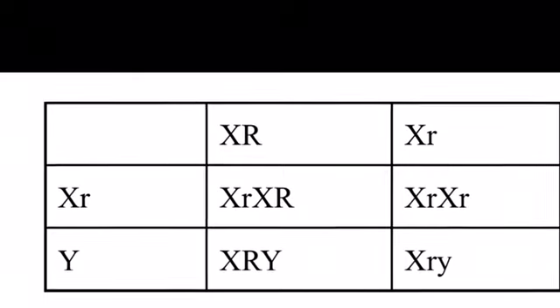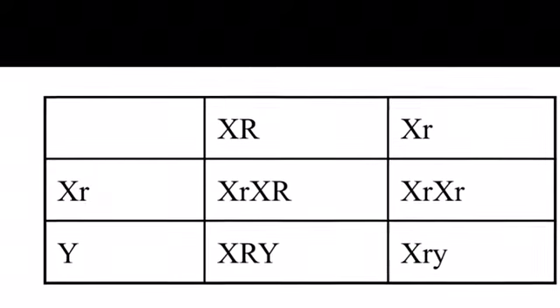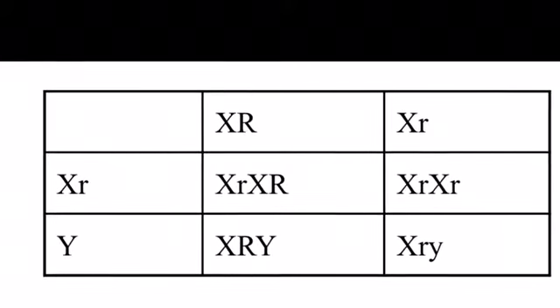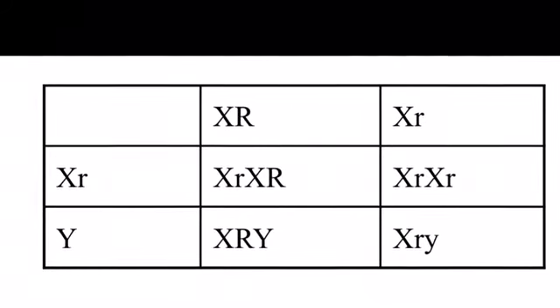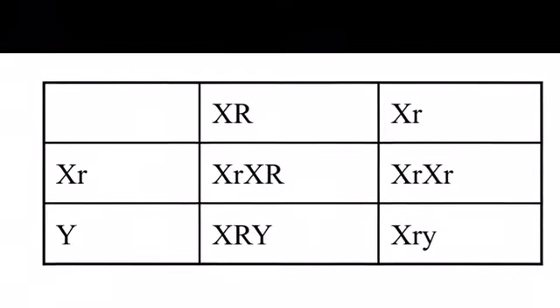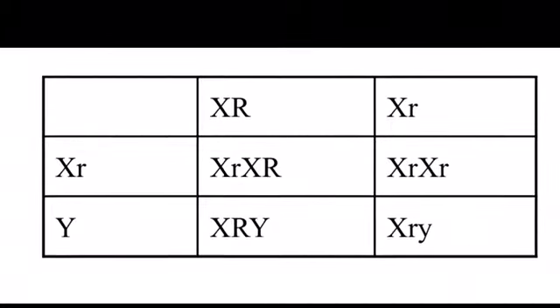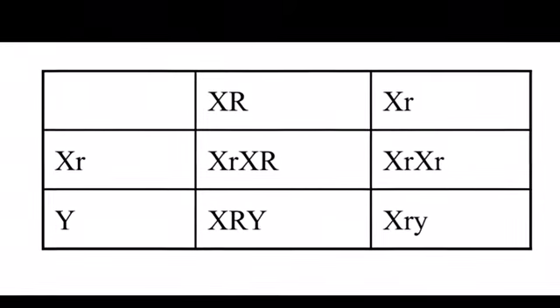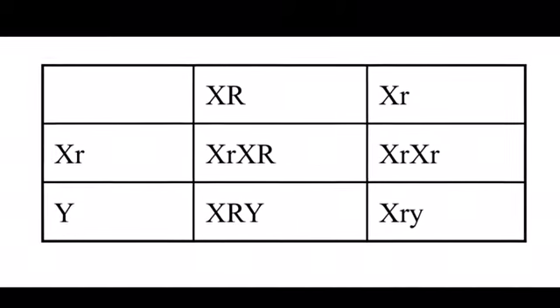5 females and 5 males from the F1 progeny were left in a vial to mate for 1 week to produce an F2 progeny. The progeny were counted, sexed, and evaluated for mutations. The data concluded that there was a mixture of males and females with both red and white eyes. The hypothesis was that there would be an equal number of progeny for each gender associated with each mutation.